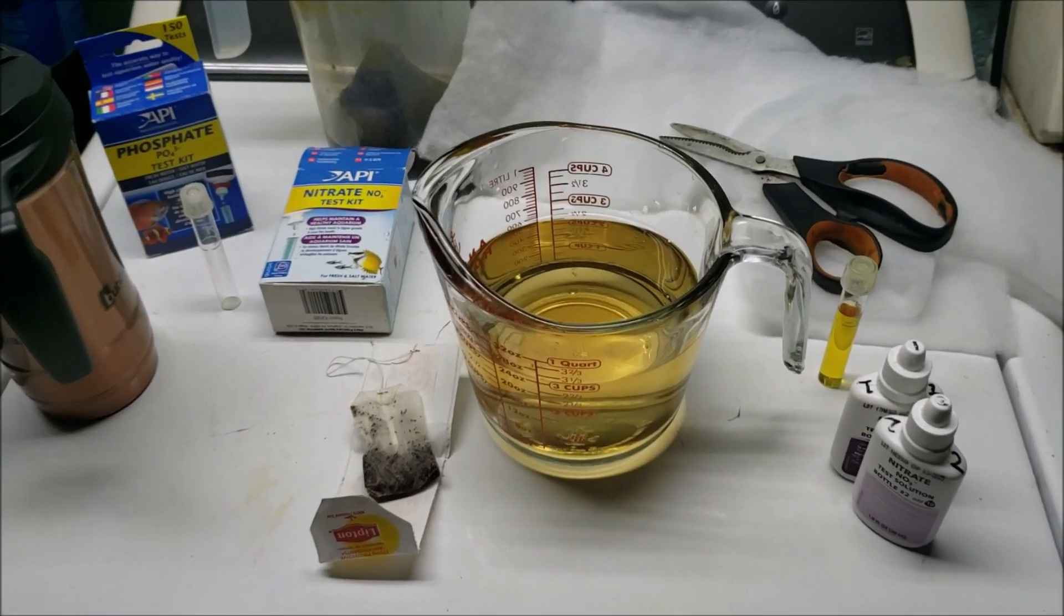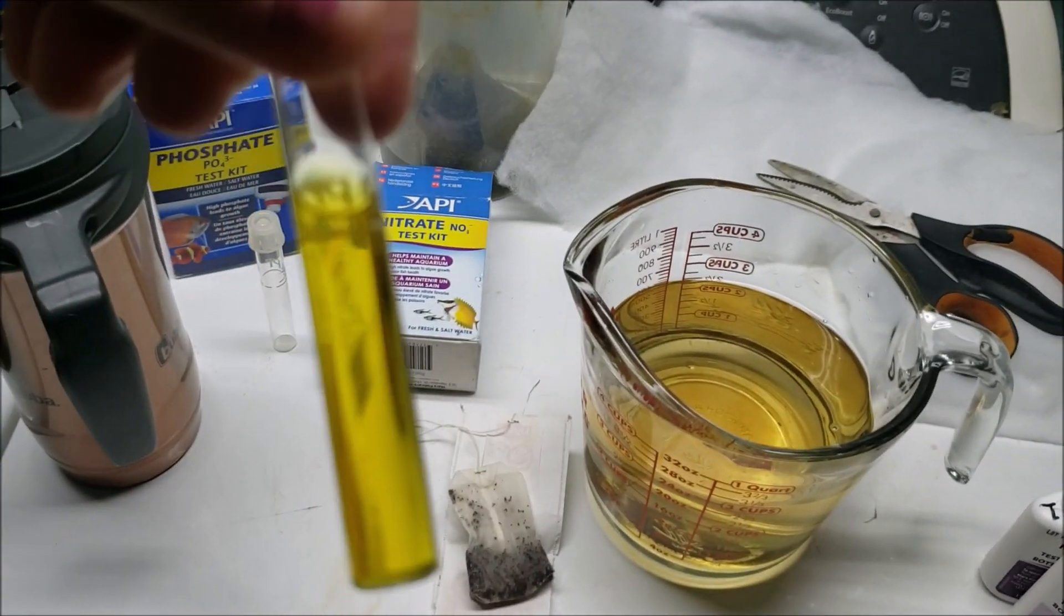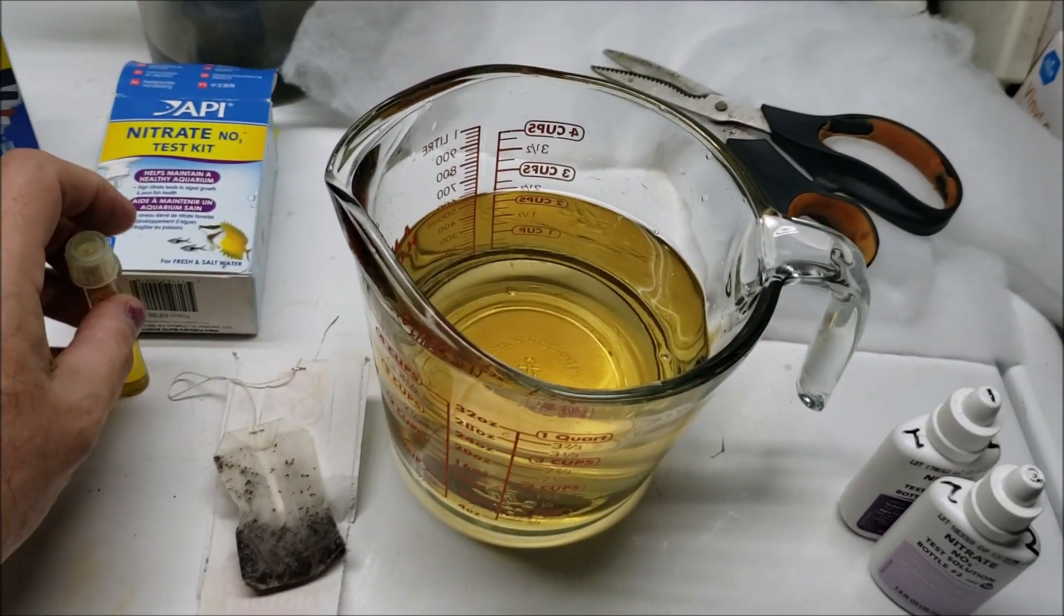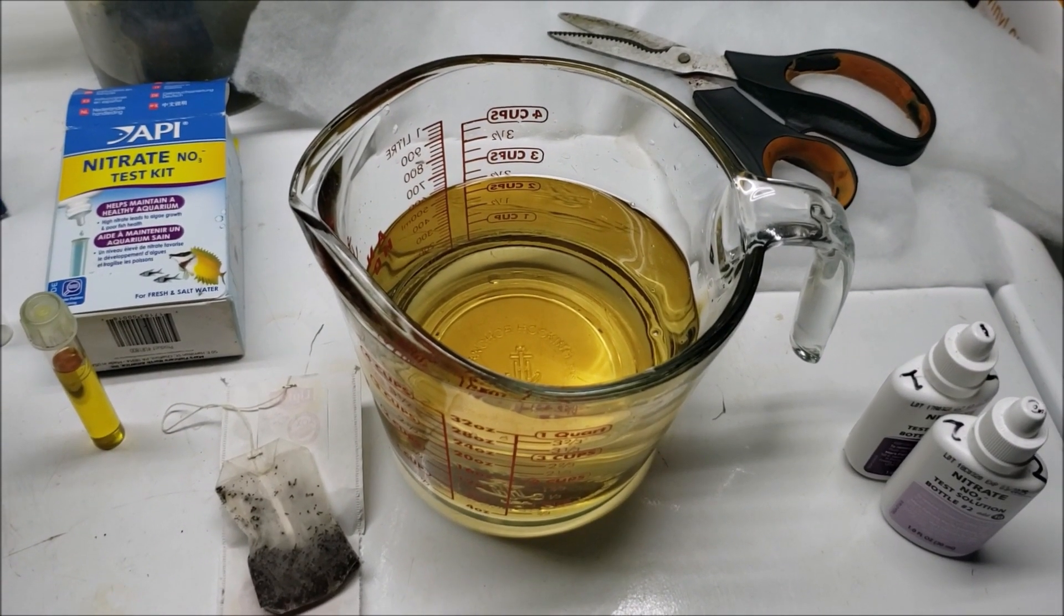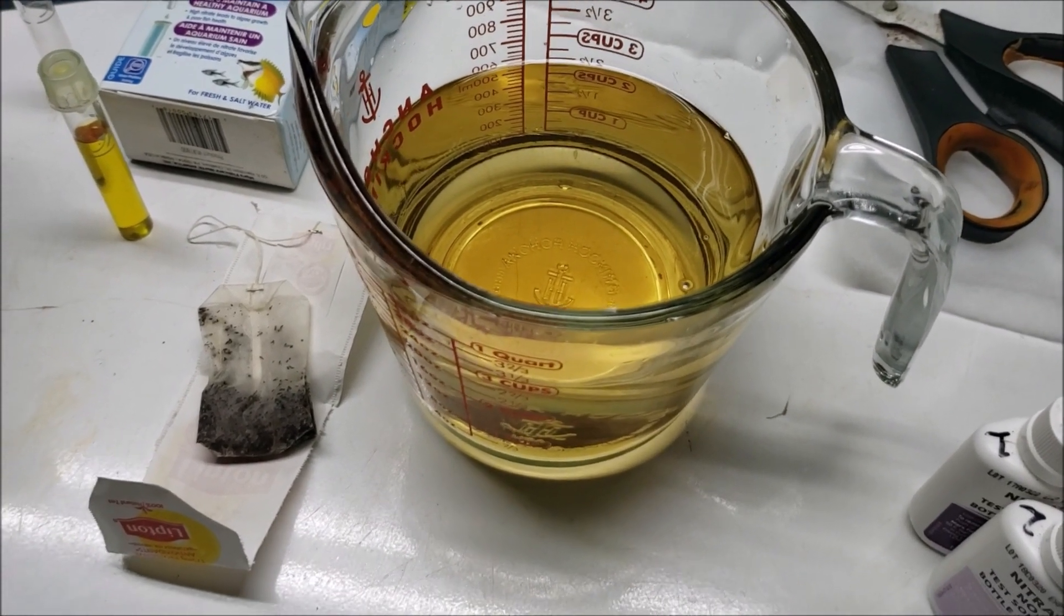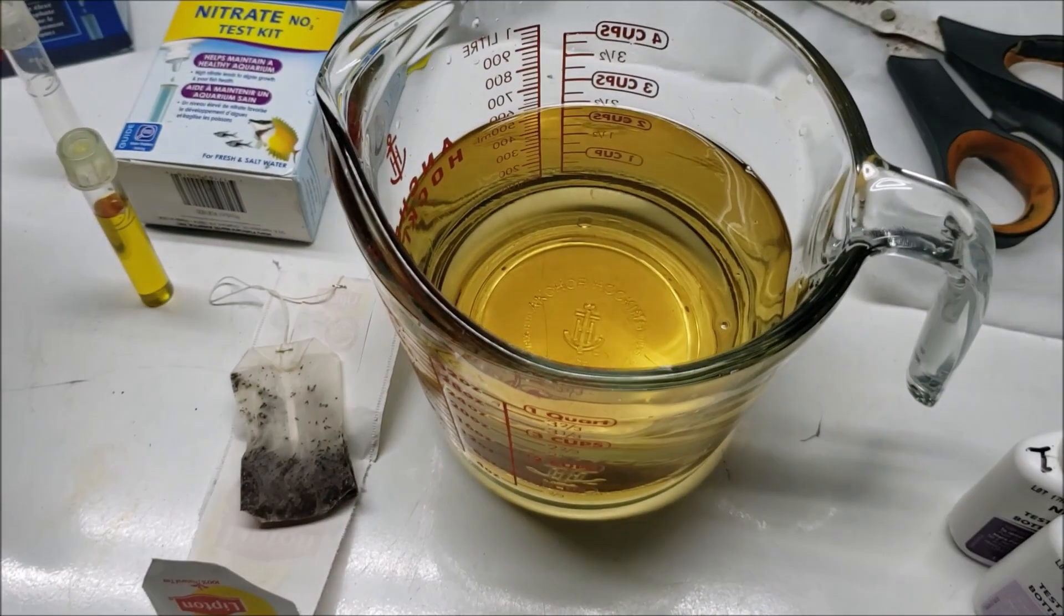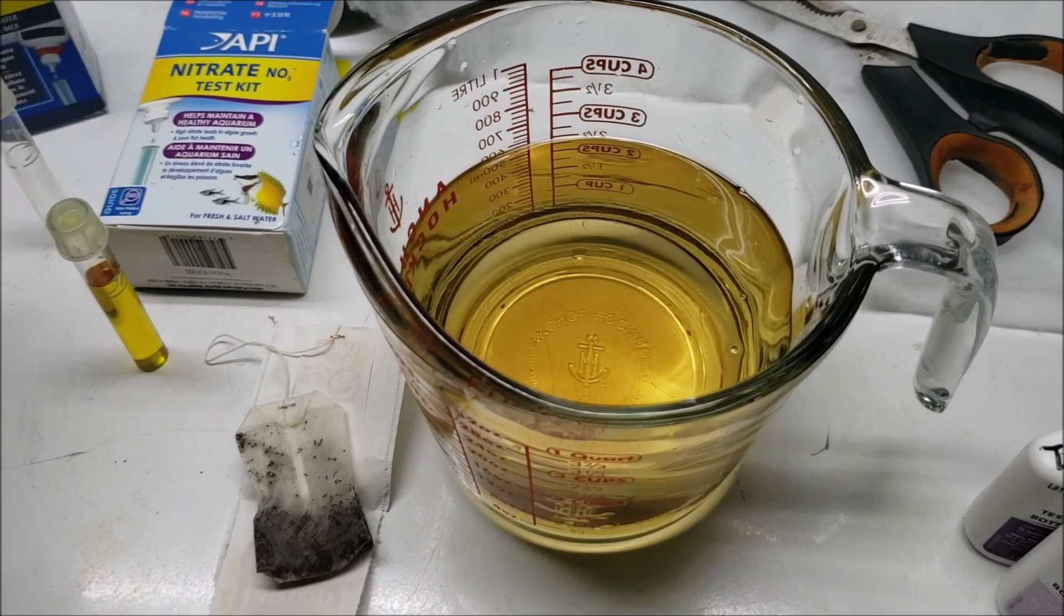All right, so here is our first test. As I suspected, it's just nice and bright yellow. We got no real color change because there is no nitrate in the water. So this is what we've done as far as staining it with tannin. That's just a tea bag, cold water. I didn't do anything to the water. I just put the tea bag in it and dipped it up and down a few times until the water got stained like that.